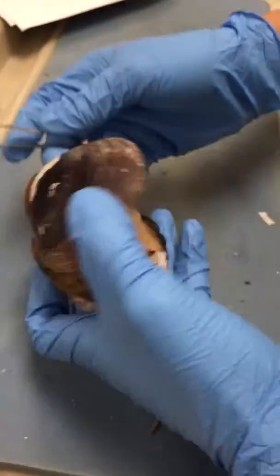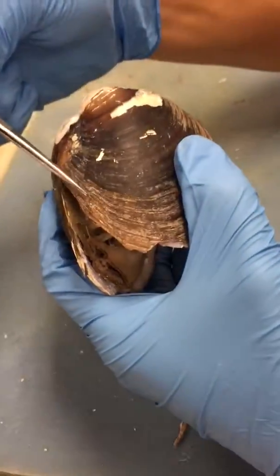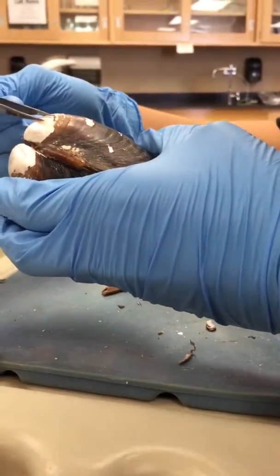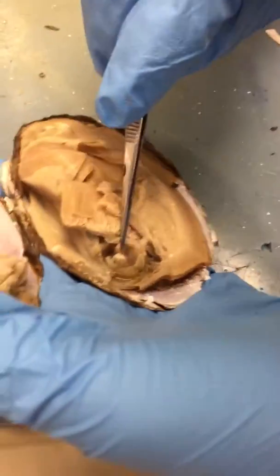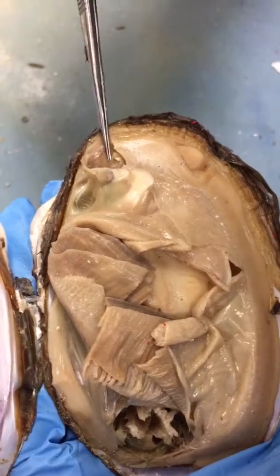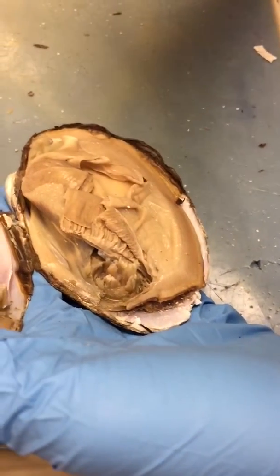Posterior is the big butt end, anterior is the small head end, so the umbo is here. The adductor muscles are the bigger ones — this is the anterior adductor muscle and this is the posterior adductor muscle.